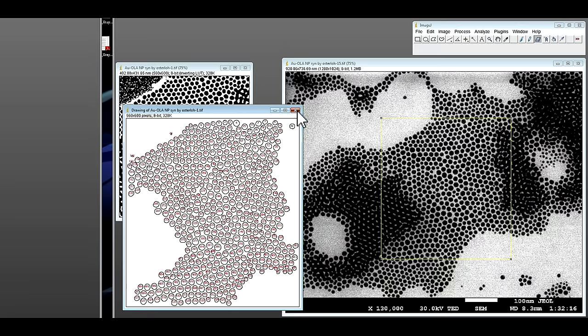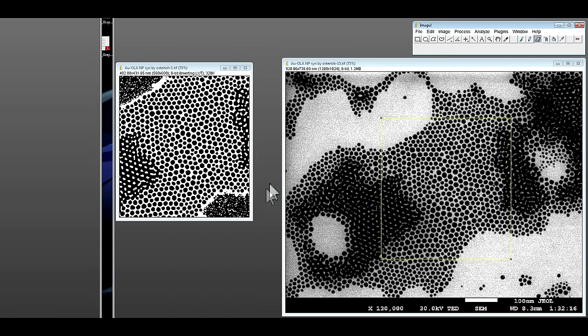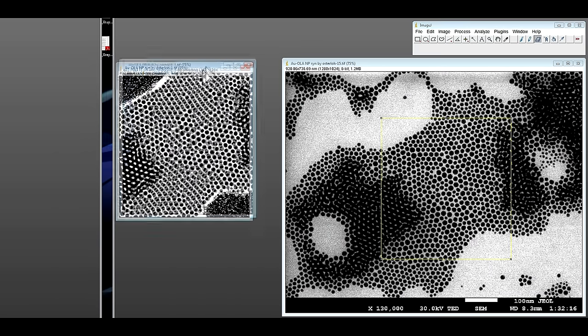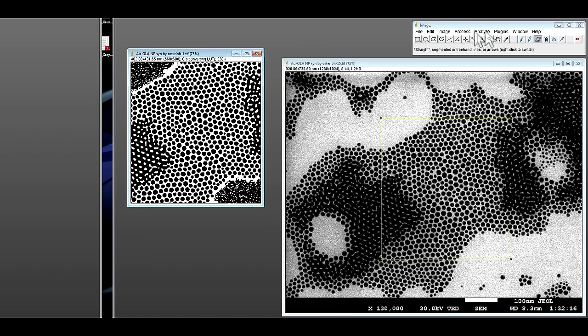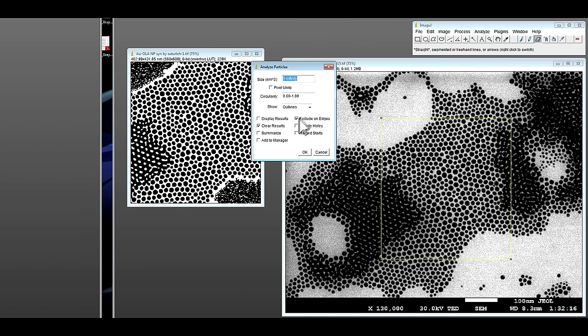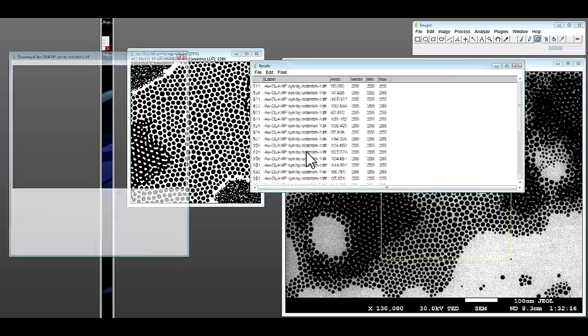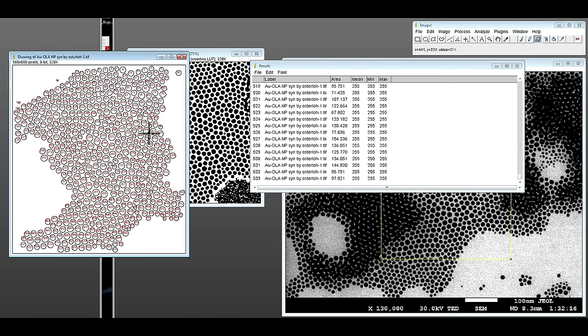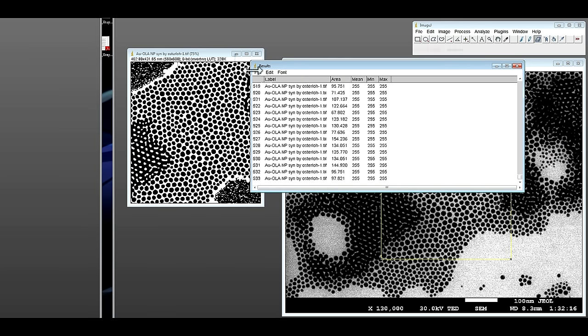Until you feel it's right, then what you can do is analyze particles, display result. OK, so you have a total of 533 nanoparticles. And file save.